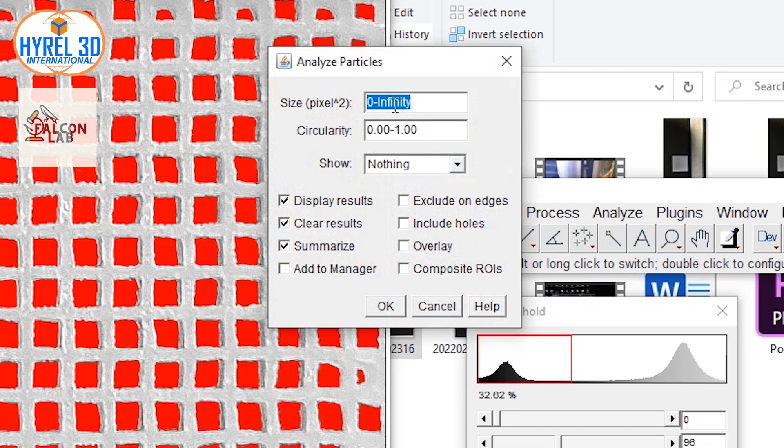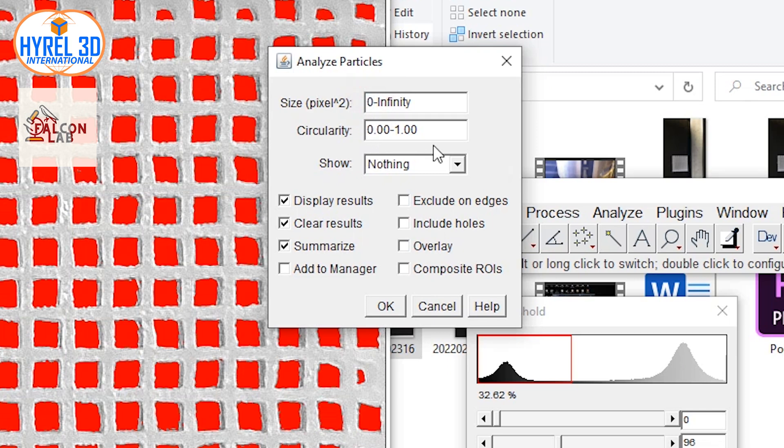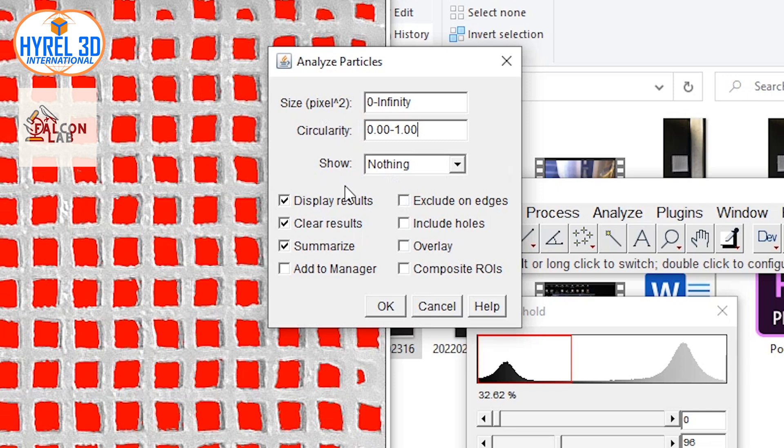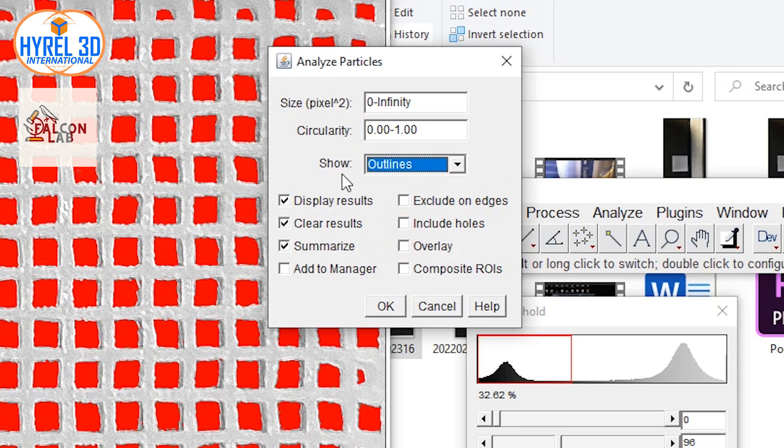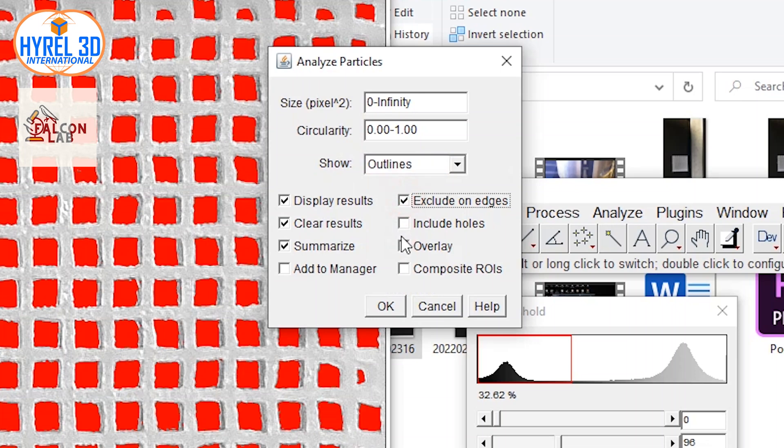Let's zero it and move on. You can eliminate the non-circular particles by changing the circularity range number. Moving to the Show option, choose Outline so we can have a better idea on where the pores are located. You can exclude readings on the edges, include holes, and overlay by turning them on.